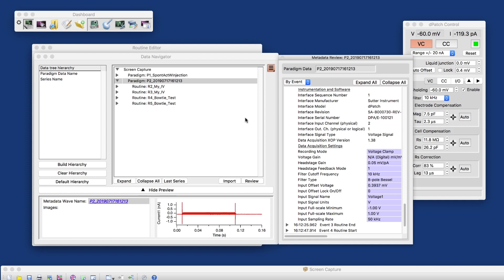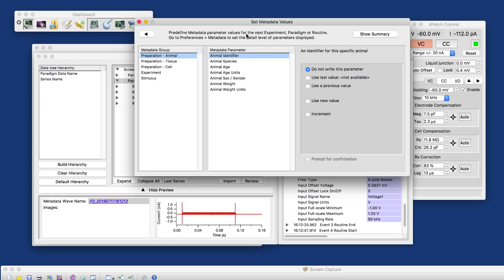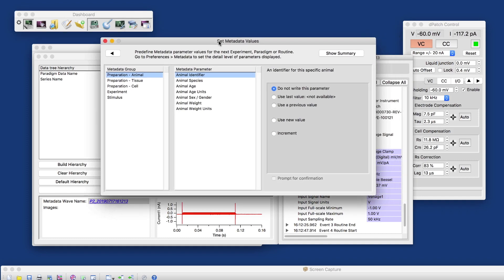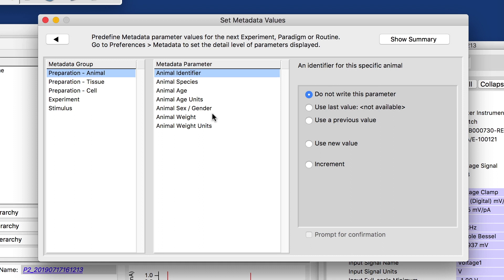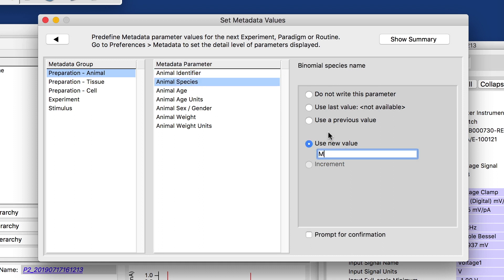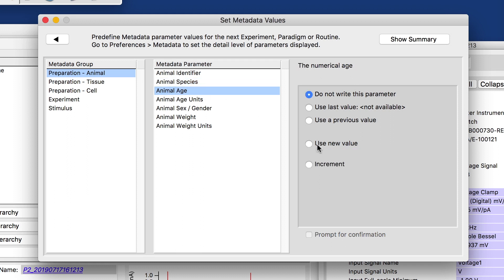What I can do is I can add metadata to data that I would record from here. So for example, for the animal species, in this case, we want to record from mouse. And the animal age could be, say, six.